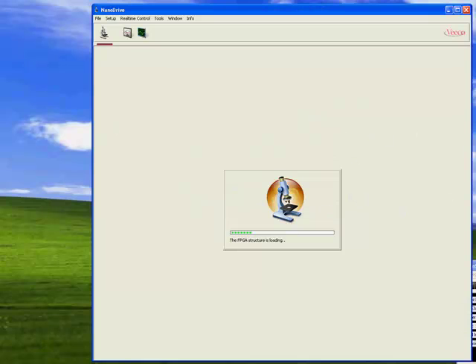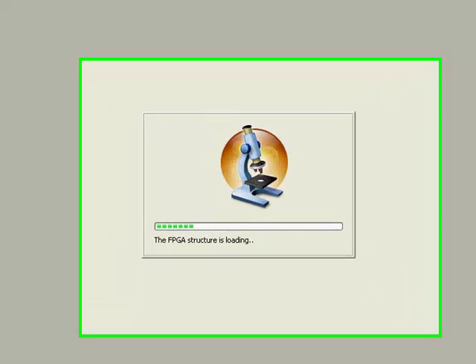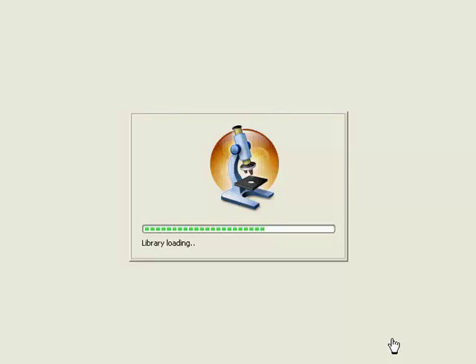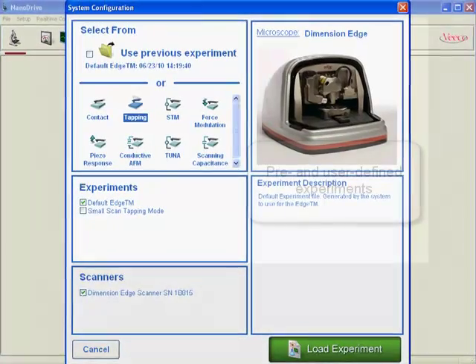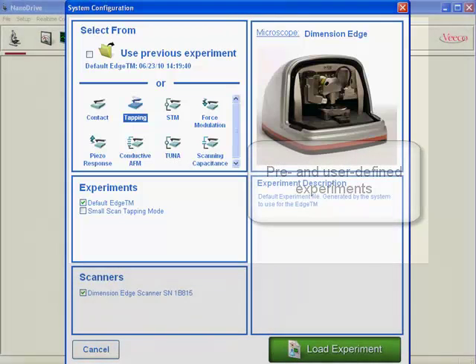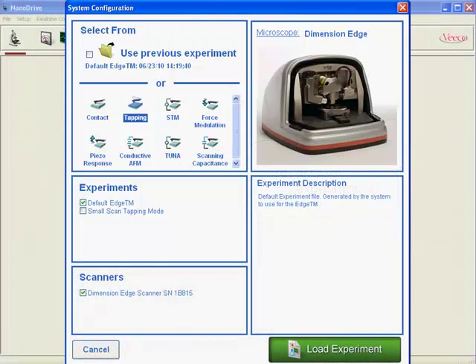Now let's get started with taking an image. We start our software. The first thing that happens is that the DSP code and the corresponding libraries are loaded from the computer onto the DSP board. Then our experiment selector is started, showing a bunch of predefined experiments with space for user-created experiments as well.